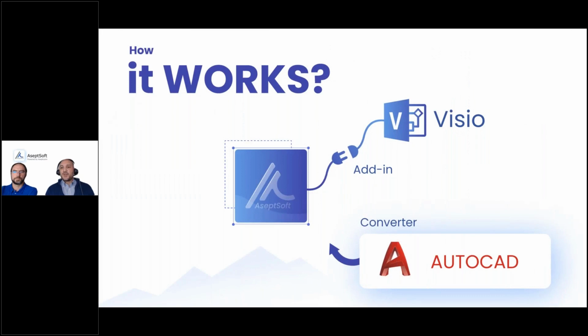Let's see first what exactly AseptSoft is. It is an add-in or plugin extension made for Microsoft Visio. This means that you need first to install Microsoft Visio, and then you can install very easily the AseptSoft plugin.